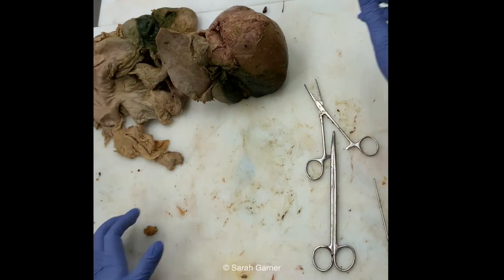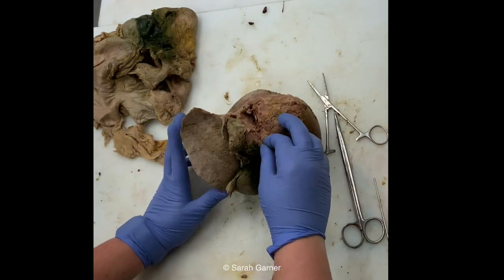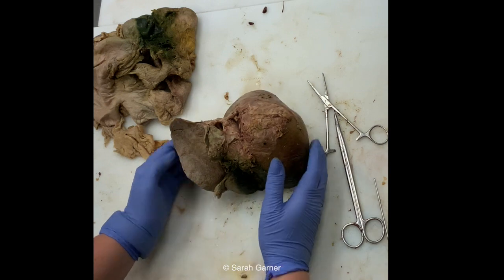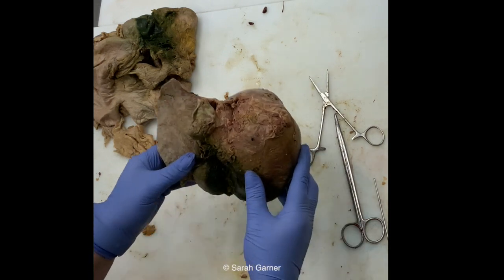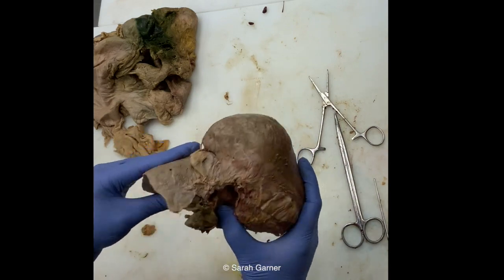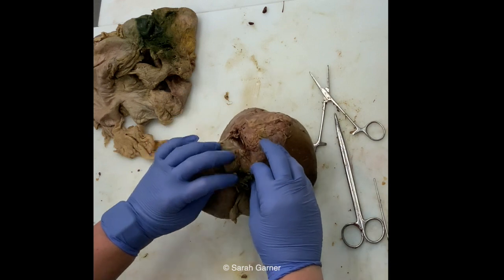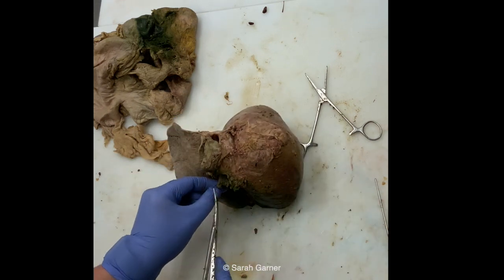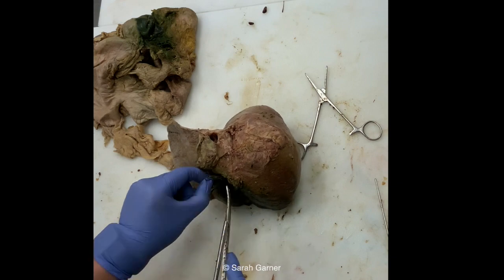Okay, then for your liver, we've already inspected the outside. We've looked at the porta hepatis. We've removed our gallbladder. We've removed our IVC and inspected the inside of that. So now you should weigh your liver. And then if there's anything abnormal on the outside, you would note that in your notes to put in your report. You can open up the vessels and inspect those, note anything.